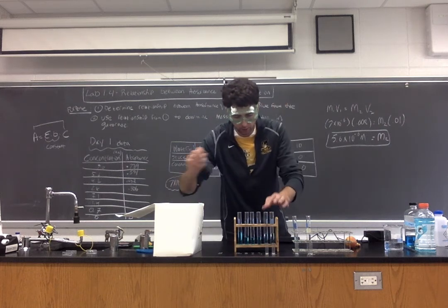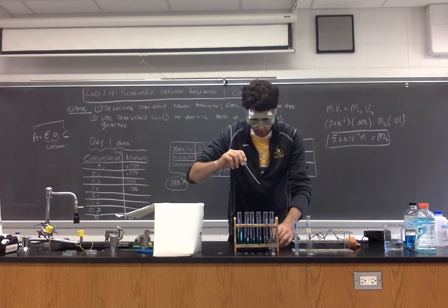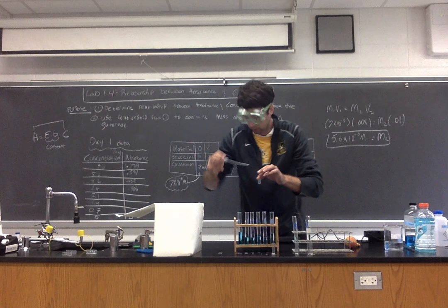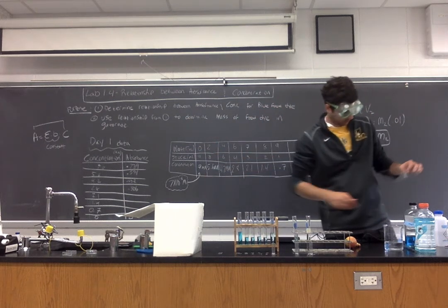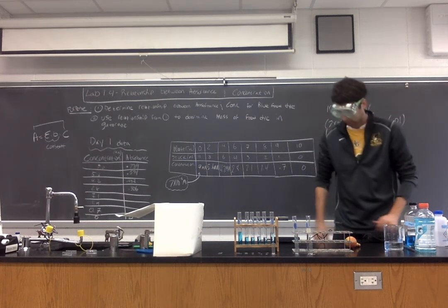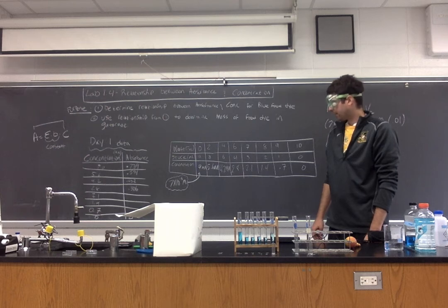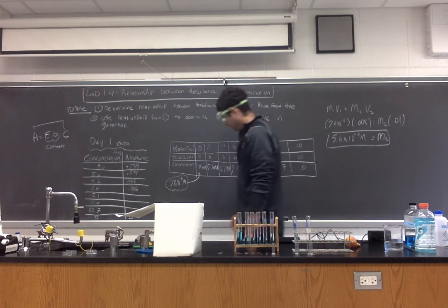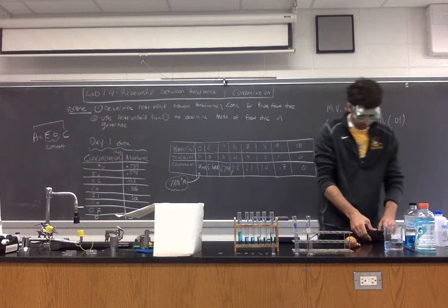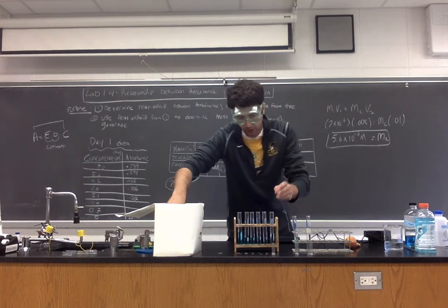Okay, our next solution. Wipe off any fingerprints. Next solution.